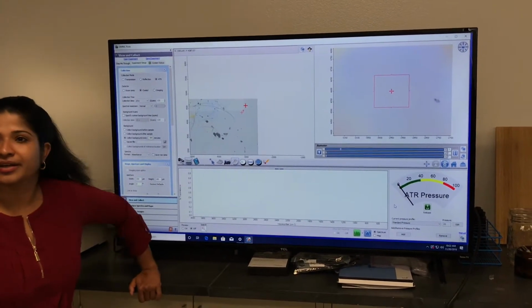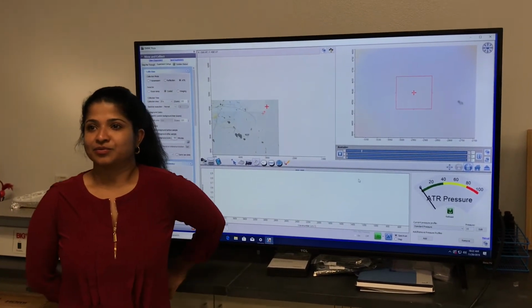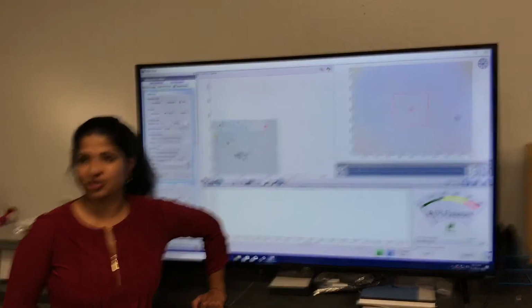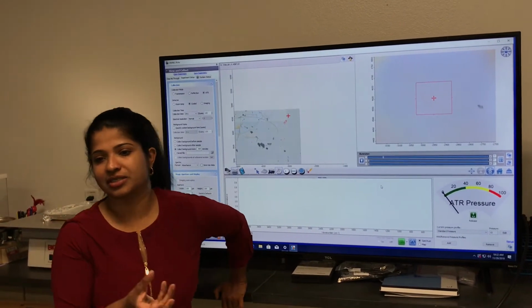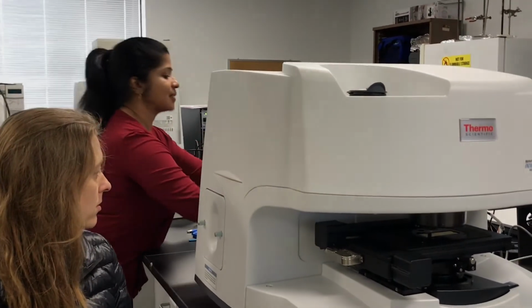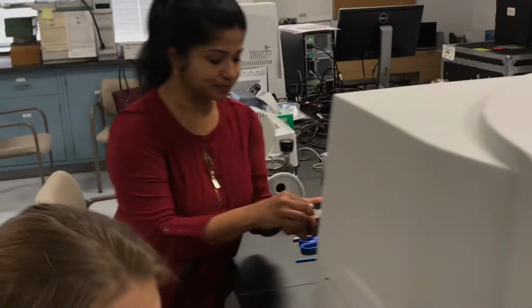So if the crystal is damaged, we just order a new one? You will have to get the new one, yes. New one. Okay. Yes. And you have to get the new one, and you can do the alignment actually by yourself also. So when you order the crystal, I'll show you how it looks. And so the key thing is, you can move samples and everything back and forth, but just don't move the crystals back and forth. So this is your germanium crystal.